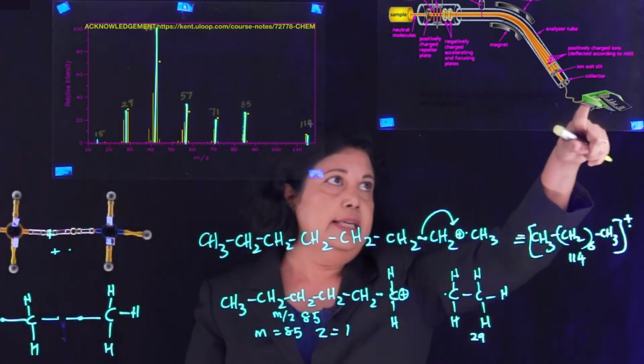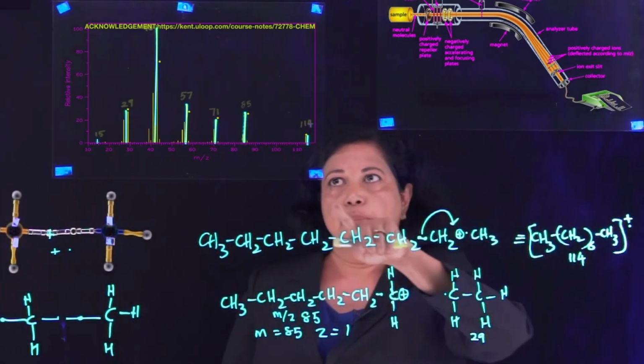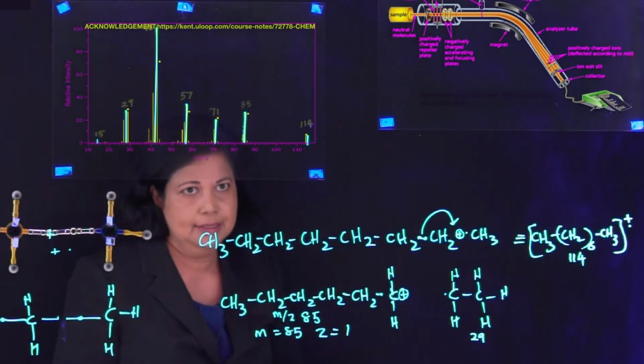It's going to send a signal every time you get one, and it's all going to go at once and print it all out. So this is literally counting the number of molecules.